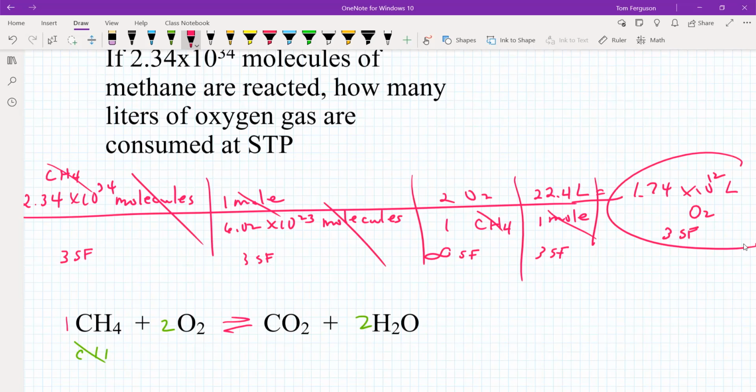Okay. All right. So today's lab is really a nice lab. Double replacement reaction, goes fairly fast. It's kind of cool. You got colors going on. On your phone, bring up the solubility table we did last time. We need that in lab. All right. Are there any questions about this process? Hopefully you see this same thing happening each time. Boom, boom, boom. 3 parts every single time.